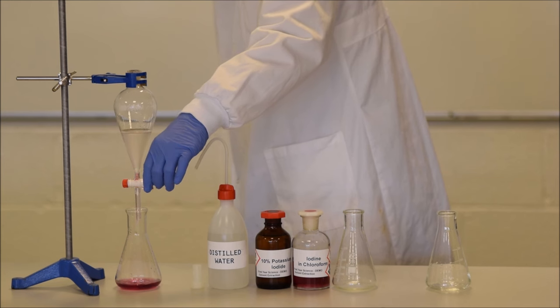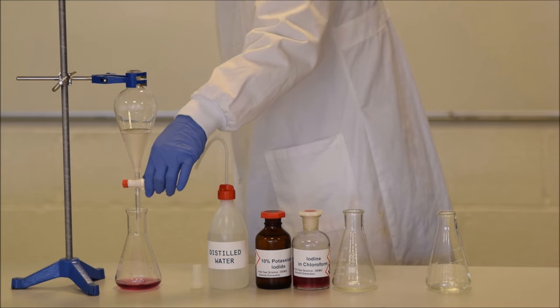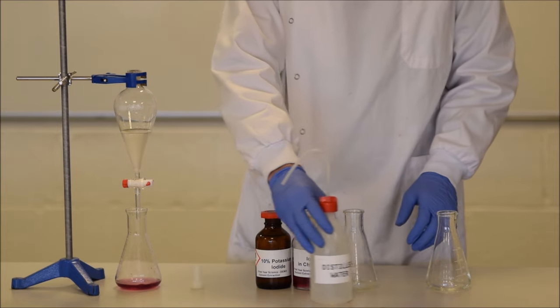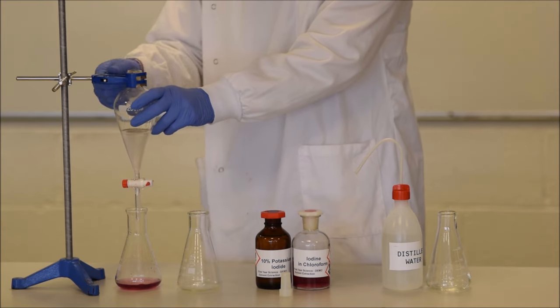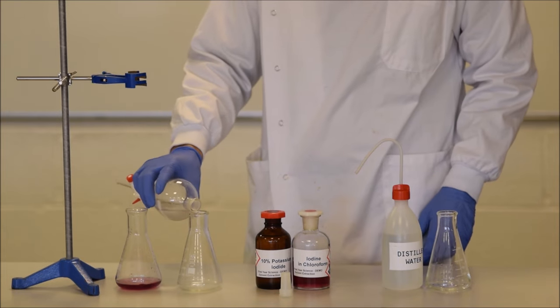It didn't do a good job of extracting it, we want it out of the separating funnel. The top layer always comes out the top of the separating funnel. So the bottom layer goes out the bottom and the top layer goes out the top. That way we avoid contaminating the two layers with the small amount of bottom layer that is going to be remaining inside the channel inside the stopcock. So just unclamp it and pour it into another conical flask.